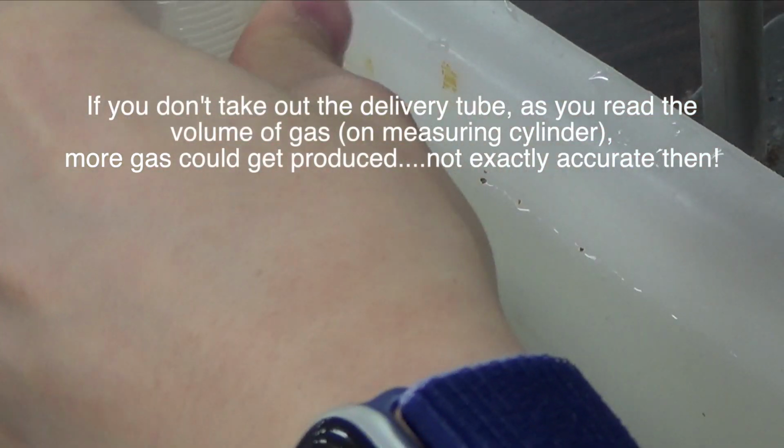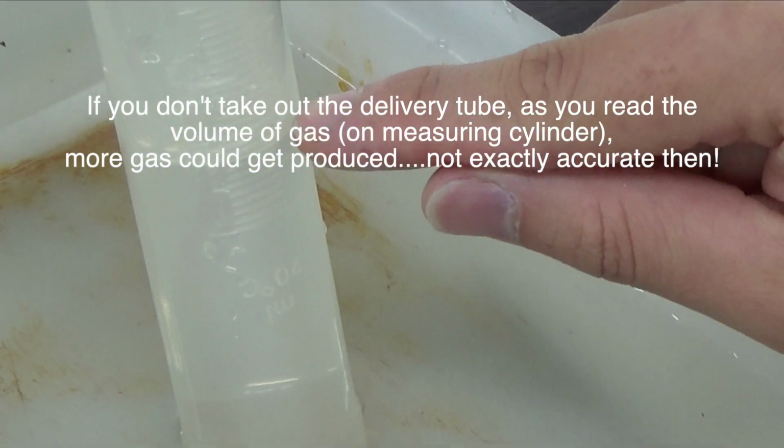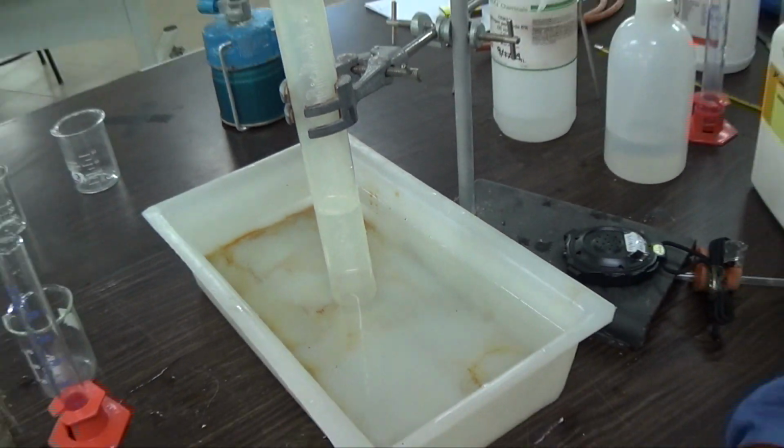So what does it read here? This is 70, this is 80, this is 80, this is 90, 91, 92, 93. So in 2 minutes, because I took away 10 seconds, in 2 minutes, 93 centimeter cube. Just now the lumpy form, in 2 minutes, you only get 18 cm cube. So in just the time taken, let me zoom out there, and let's just recap back on what we have learned.